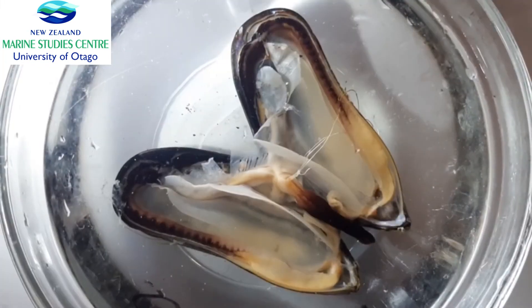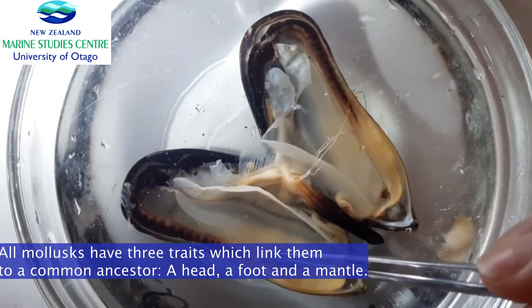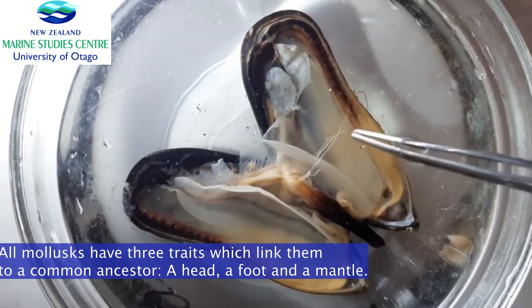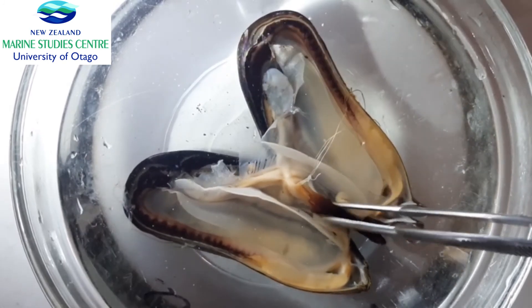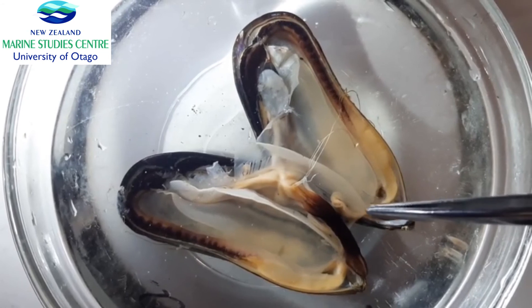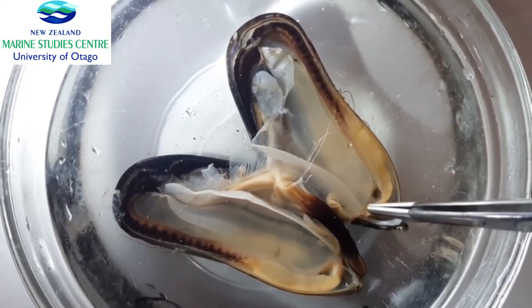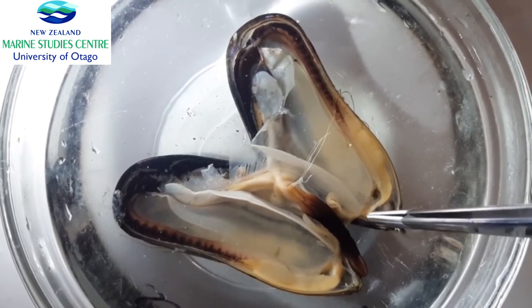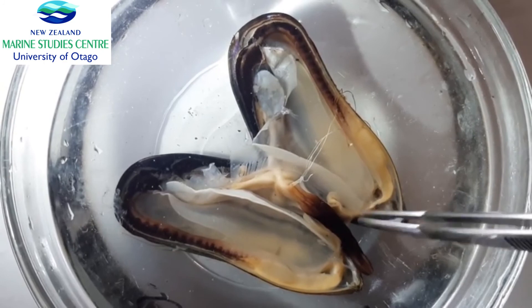Going back to the three defining traits of molluscs: the head, the strong muscular foot, and the mantle. We've already seen the mantle — the outer tissue — and the strong muscular foot. The head is located where the mouth is on a mussel, which is down at the anterior end. It's not a visible head, but you can see the mouth if you look really closely, placed underneath the labial palps.